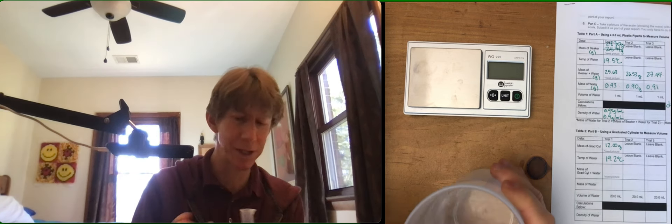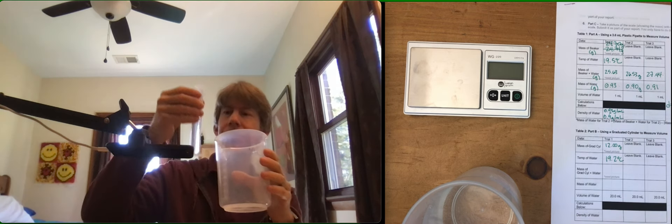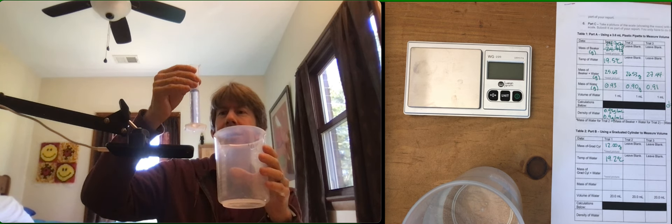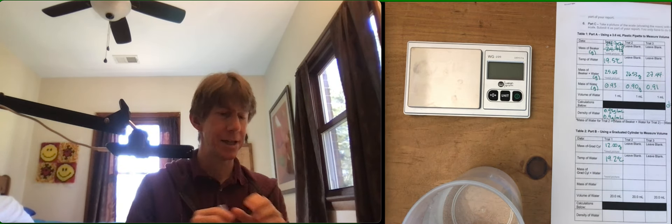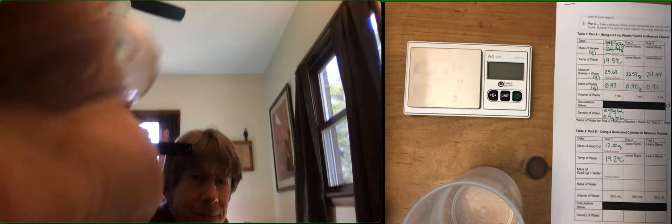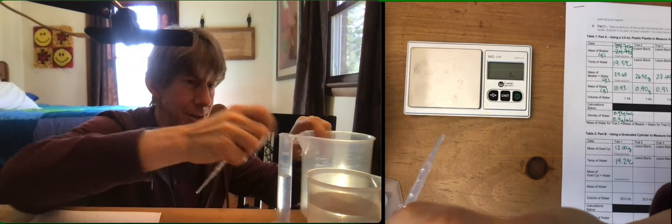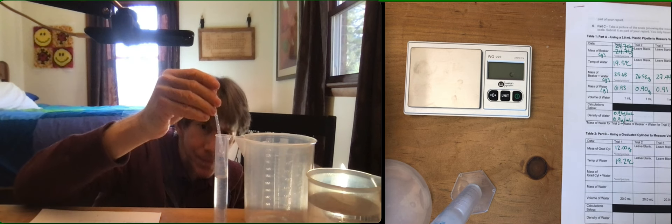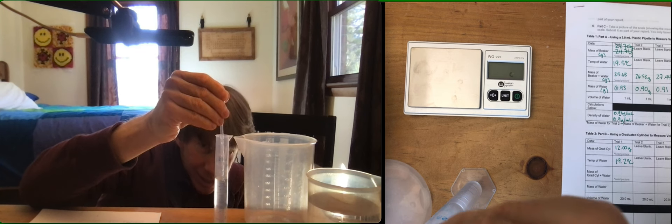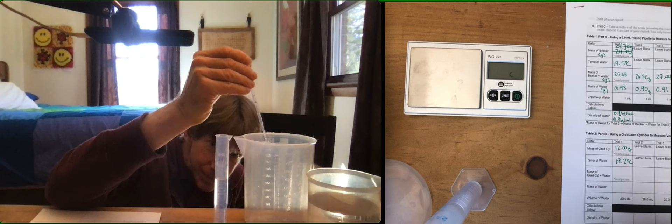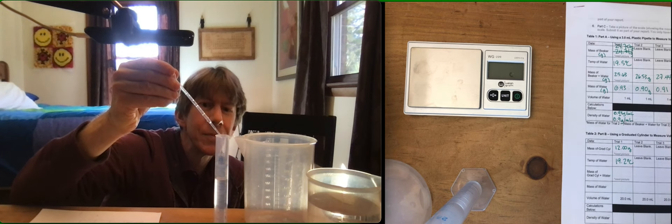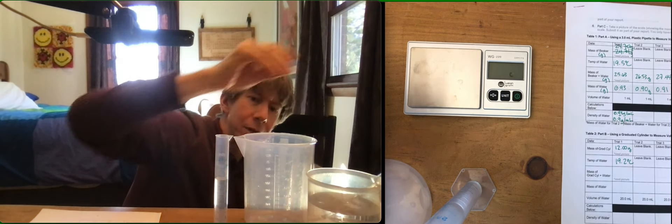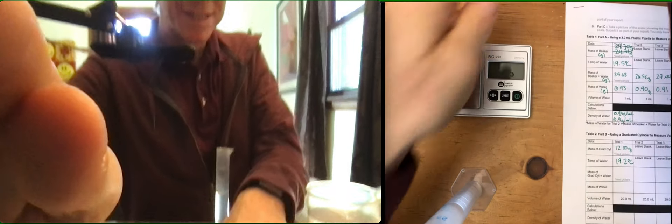Oh, I wanted 20 didn't I? I'm going to pour this into my waste. I know it's just water, but good technique says don't pour it back into the container, pour it into the waste. I'm a little high right now as far as my 20 milliliter measurement. I'm looking straight across and I'm taking volume out until I get down to the bottom of that meniscus right on that 20 line. Might have gone a little too low. Water can go back. I actually got a little bit of water on my scale, but just on the display, at least it's not on my pan.